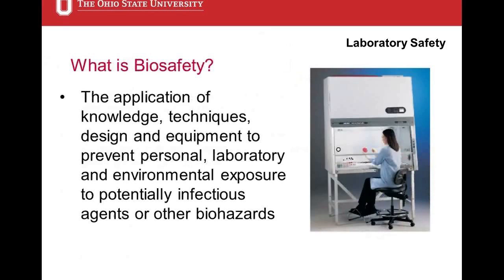Biosafety is kind of a compilation of a lot of different sciences. So it's not like chemistry or microbiology or physics where you just go and study that discipline. It's a lot of things. It's engineering, it's microbiology, it's a little bit of chemistry. All those things put together to learn how to work safely with these agents.